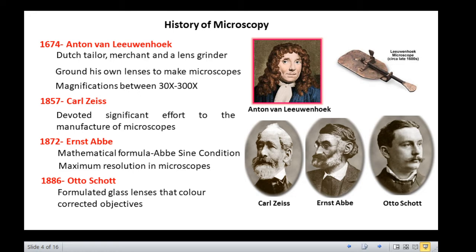The creation of the apochromatic objectives eliminated color aberrations, which greatly assisted bacteriologists in identifying infectious bacteria and brought the resolving power of the microscope to the limit we know today.